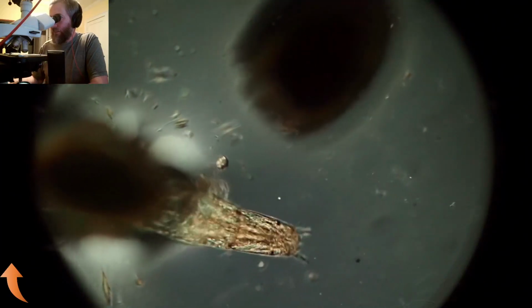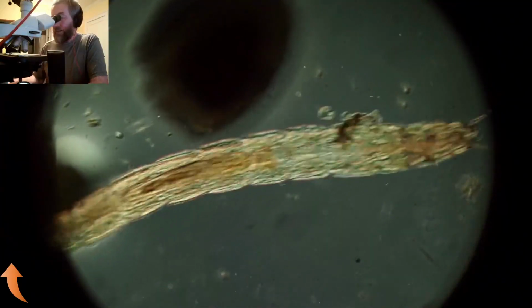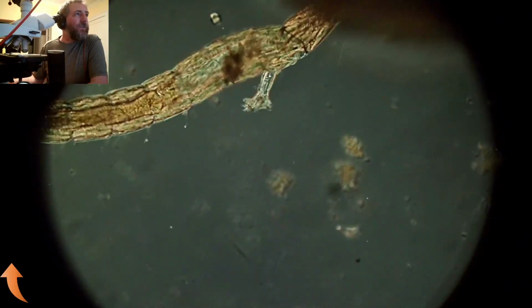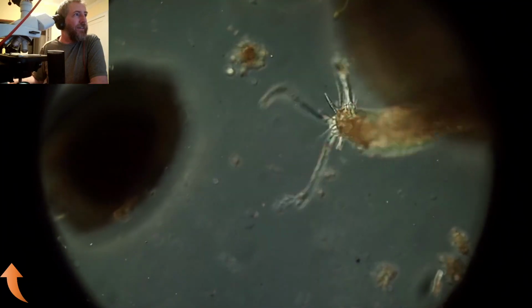So they molt something like 5 or 6 times before they reach adulthood. Oh, and that's a giant chironomid. That's a chironomid midge, or larva. Monstrous worm-like thing is actually a non-biting fly. It's got a little arm that it's crawling, or 2 arms it's using to crawl around with, and it's got 2 arms in the back, or legs in the back right here, helping it crawl. They have fan-like endings on the edges of them.